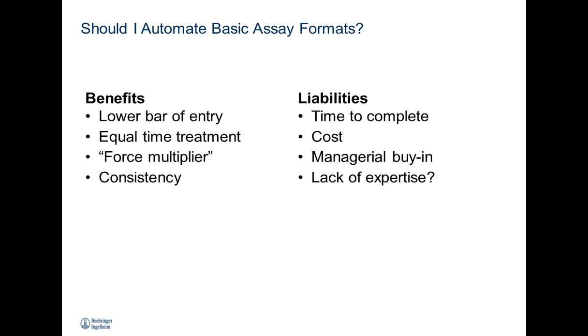I tend to refer to automation assets within a lab as a force multiplier. You're allowing one scientist to do the work of two, if they can set up a platform and let it run while doing other things. It also provides a degree of consistency in your sample handling and your reagent dispensing. We all know how to pipette, and we should all know that we do not do it exactly the same every time. There is a degree of variance with that.